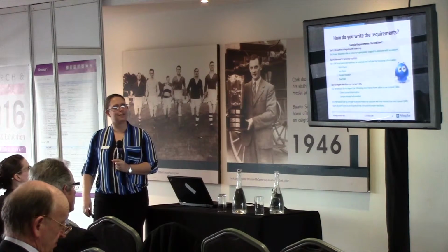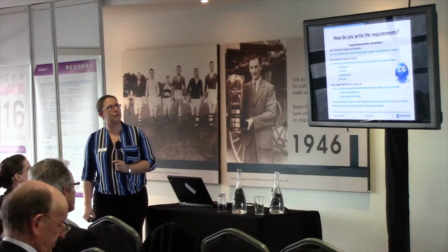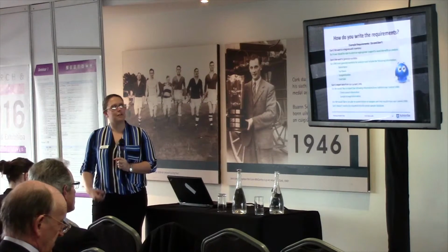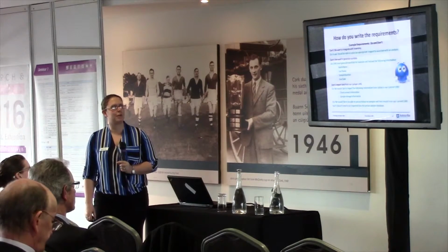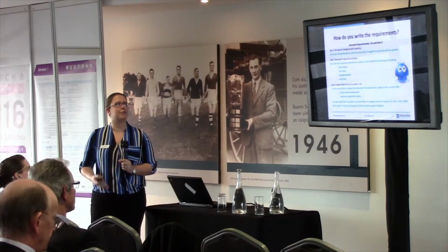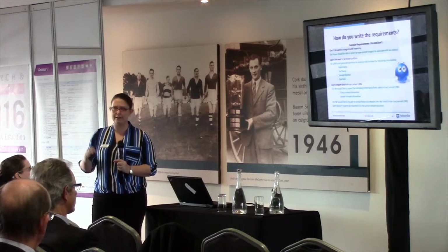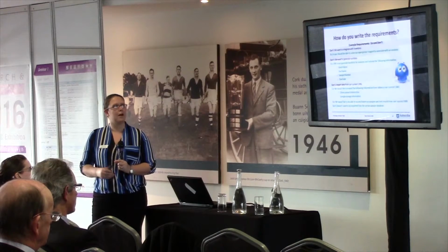I quite like this little slide here with the do's and don'ts of what to say to us. So, we want to integrate with inventory. Well, that could mean a whole list of different things. So, a user should be able to select appropriate reagent and associate with analysis. Makes a lot more sense. You need to dig down just a little bit deeper when producing these requirements documents.